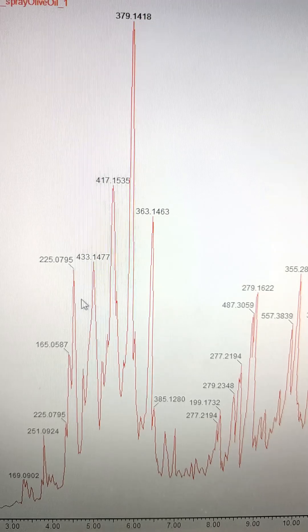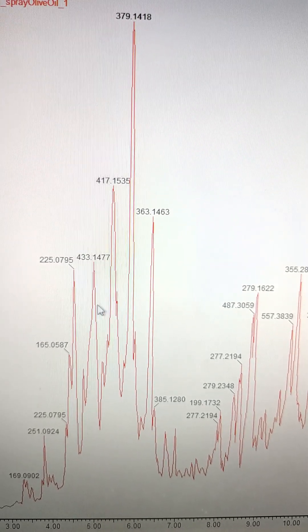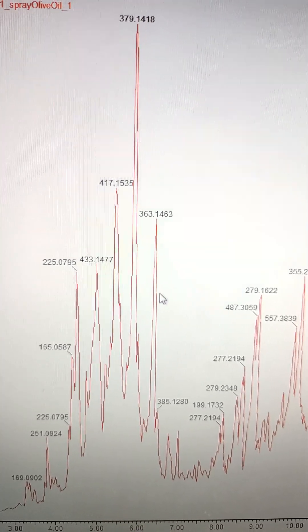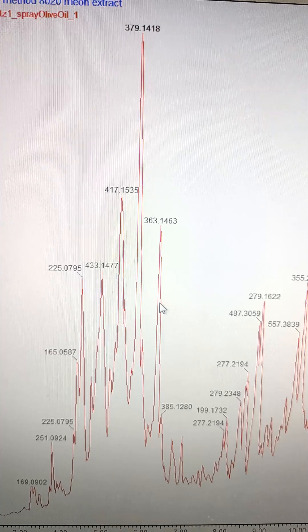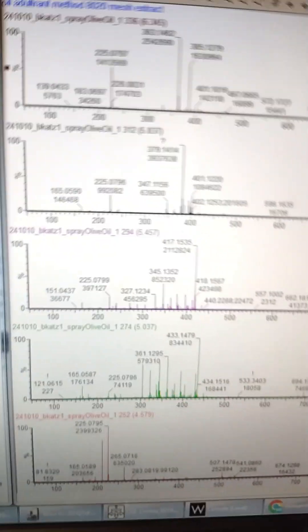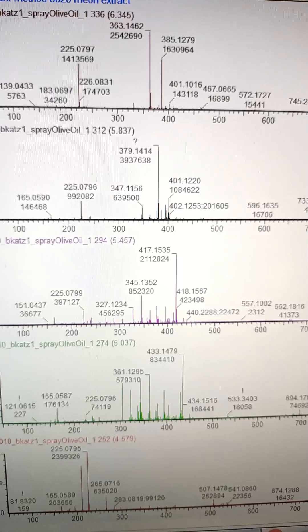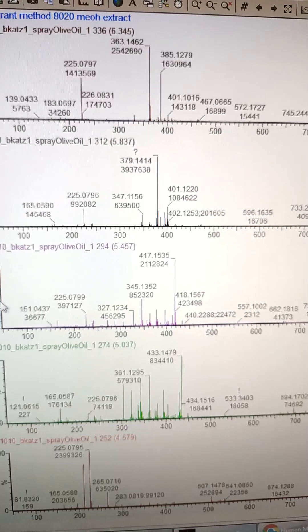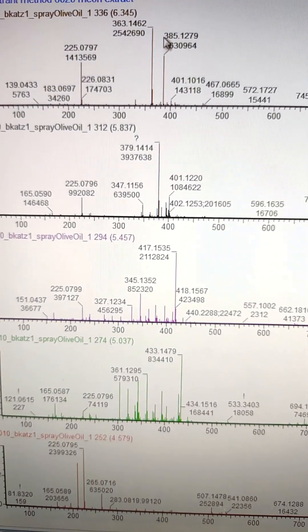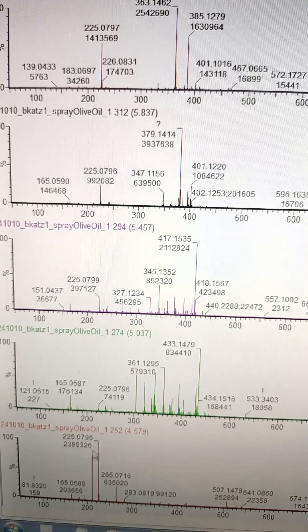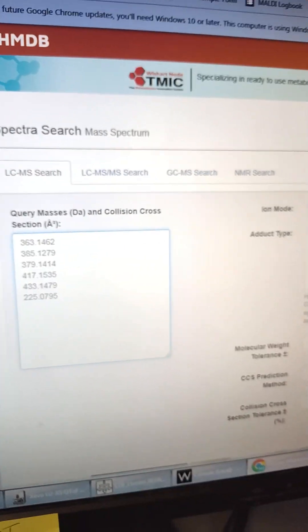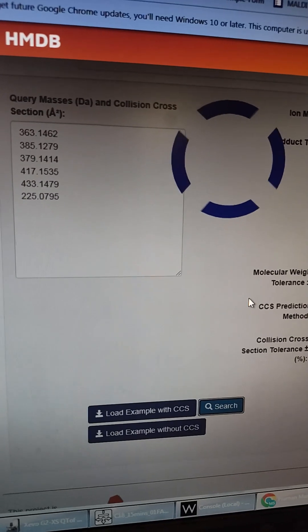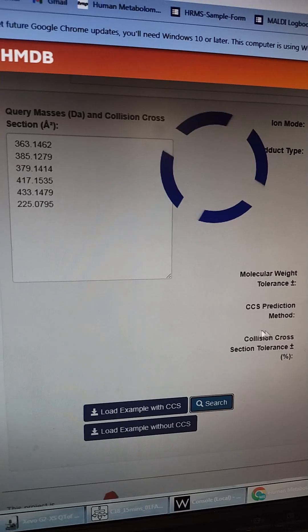The masses I'm going to look at - let's do 225, 433, 417, 379, and 363. You can see this is what the data looks like. Lots of stuff going on here. We're going to send this to Untargeted and maybe post another video on this. So I took all these masses, just went for the most intense things. And this is what I'm going to search. Protonated and sodated 0.02 error.